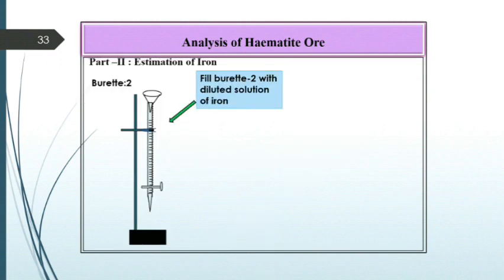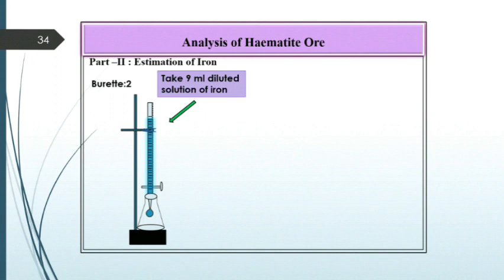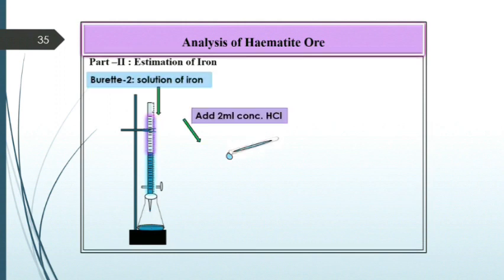Now Part 2, estimation of iron. To estimate the iron, fill burette number 2 with diluted solution of iron, then take 9 ml diluted solution of iron in a clean and dry conical flask. Add to this solution 2 ml concentrated HCl.